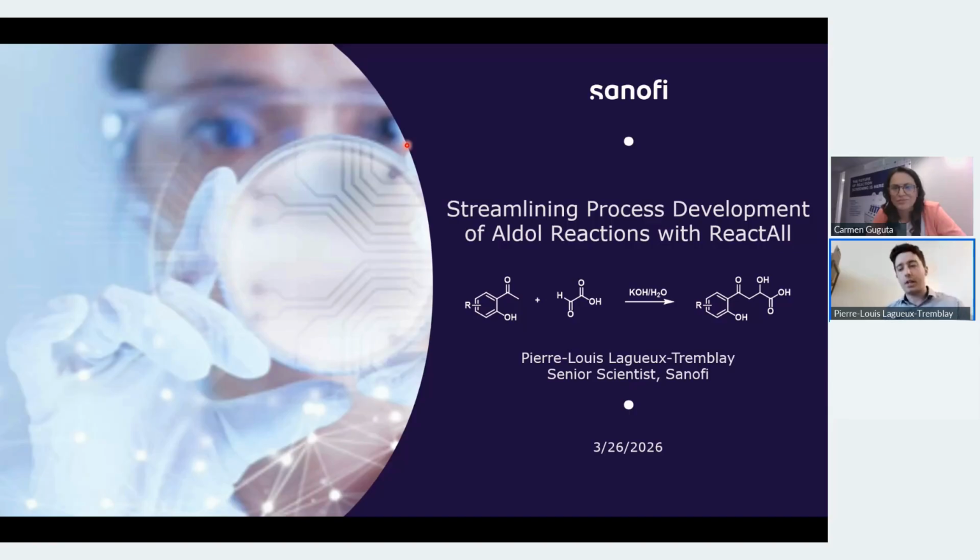So this continuity of resemblance between small scale and large scale makes it more reliable to understand the reaction profile, because both the chemistry and the hardware device you use to run this reaction make them more comparable.